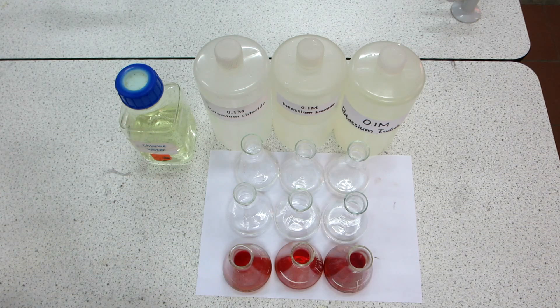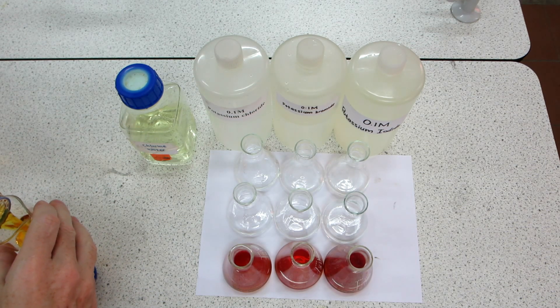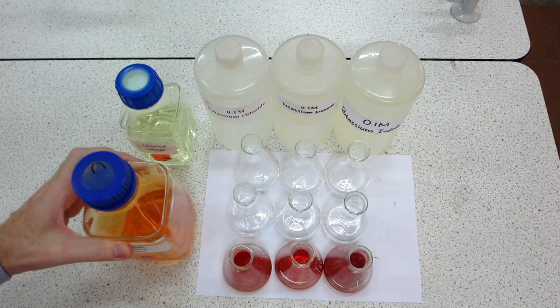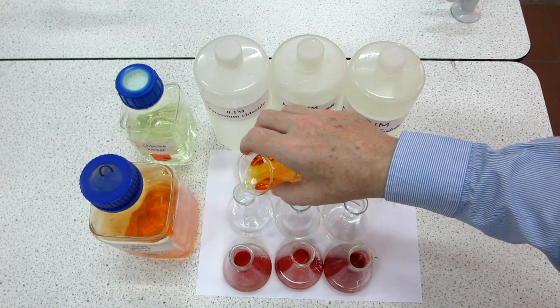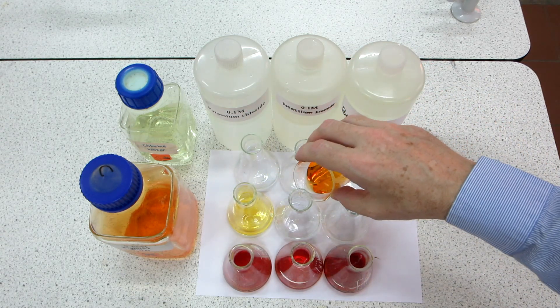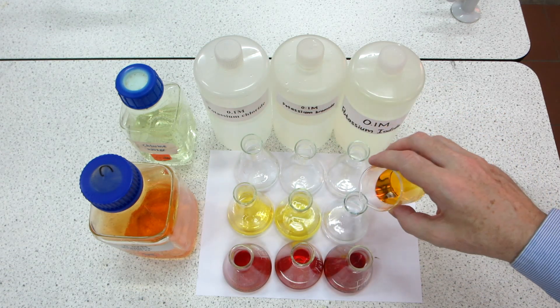Into the second sequence of flasks we're going to put bromine water. This is quite nasty stuff — there's the bromine water, quickly put the stopper back on the bottle. The bromine water is 0.02 molar. Let's introduce that into the three flasks: into the first flask, bromine water in potassium chloride; into the second, bromine water into potassium bromide; and finally, bromine water into potassium iodide.